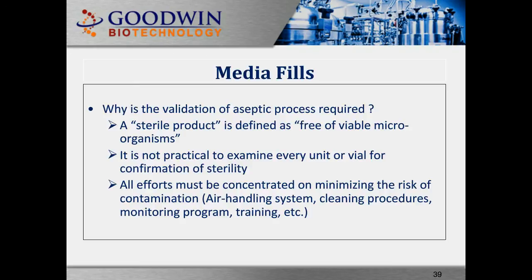Why is the validation of aseptic process required? What is a sterile product? Sterile product is defined as free of viable microorganisms. It is not practical to examine every unit or vial for confirmation of sterility because biological material drug product cannot go through 100% sterilization, as Jeff mentioned.